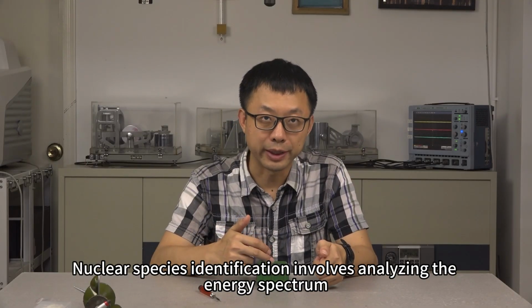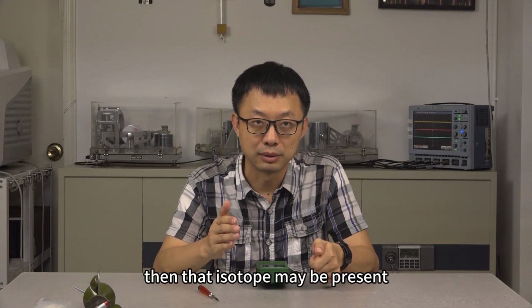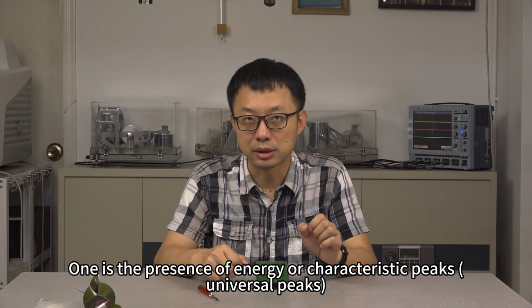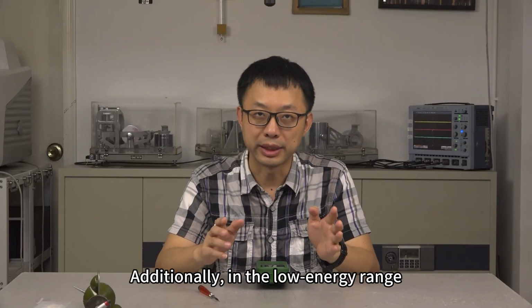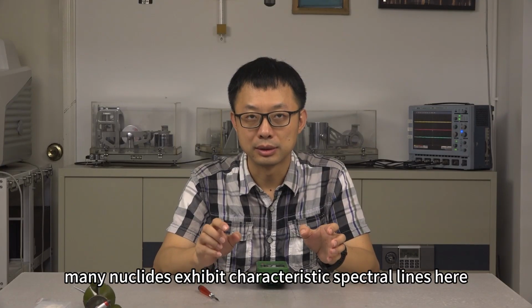Nuclide identification involves analyzing the energy spectrum to determine possible radioactive isotopes. If characteristic peaks for a specific isotope appear on the spectrum, then that isotope may be present. However, this isn't 100% certain. Several scenarios are possible here. One is the presence of universal peaks, which may be shared by numerous nuclides, such as the 511 keV positron-electron pair annihilation peak. Additionally, in the low energy range, such as below 100 keV, many nuclides exhibit characteristic spectral lines here.